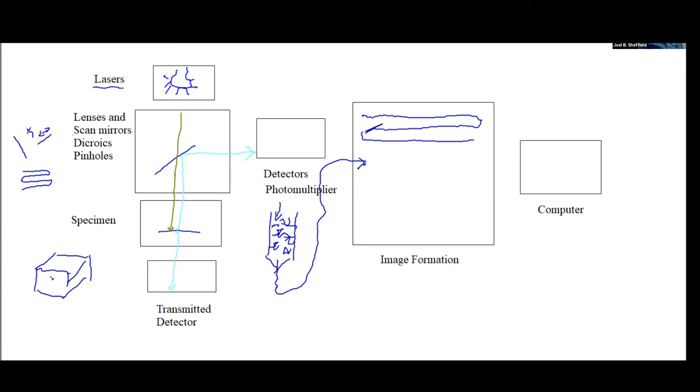You're going to be getting the scan that comes from the spot going horizontally across the sample, but also because it's focused to a really small spot, it'll only go to a certain part of the depth, and you'll get an image from a particular depth in the sample. Now, you've got a machine that's doing two things so far. It's scanning, creating fluorescence, and it's focusing just on one narrow level of material in the sample. So what you could do now is not only that, you can accumulate an image in one plane.